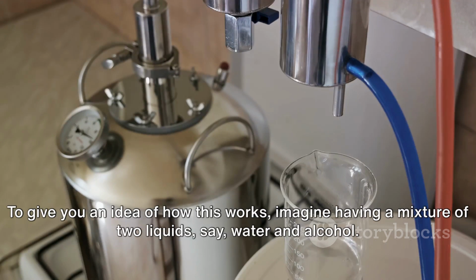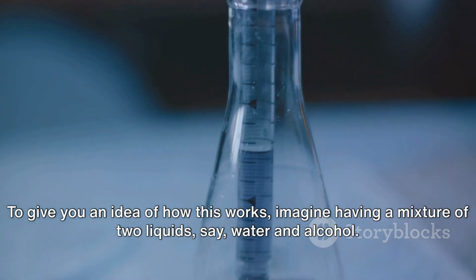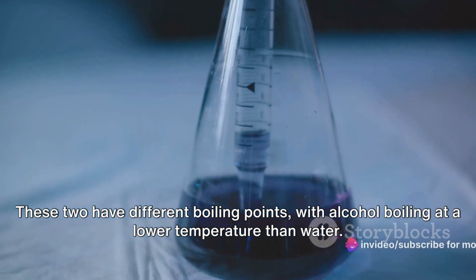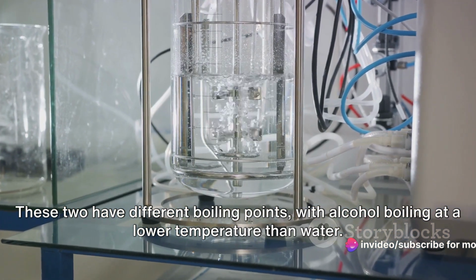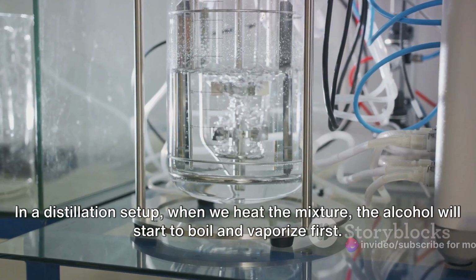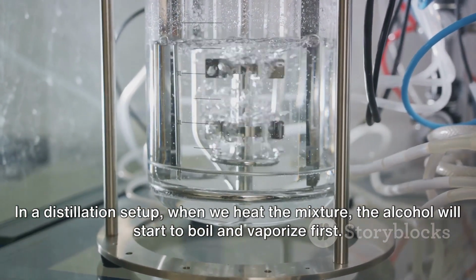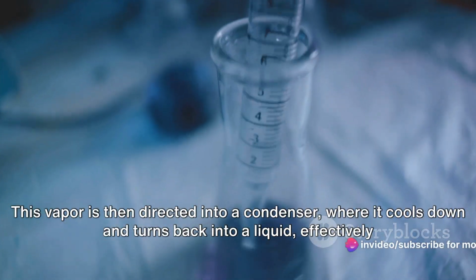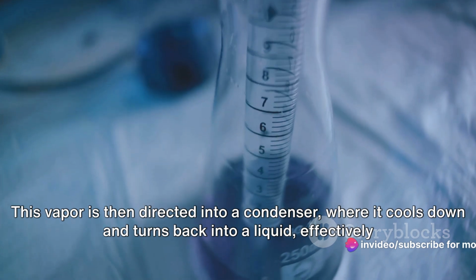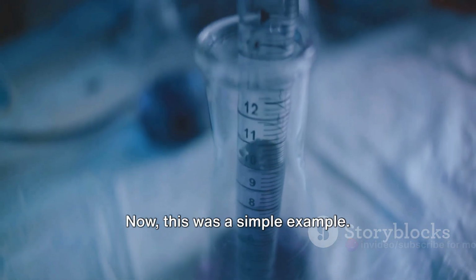To give you an idea of how this works, imagine having a mixture of two liquids, say water and alcohol. These two have different boiling points, with alcohol boiling at a lower temperature than water. In a distillation setup, when we heat the mixture, the alcohol will start to boil and vaporize first. This vapor is then directed into a condenser, where it cools down and turns back into a liquid, effectively separating it from the water. Now, this was a simple example.